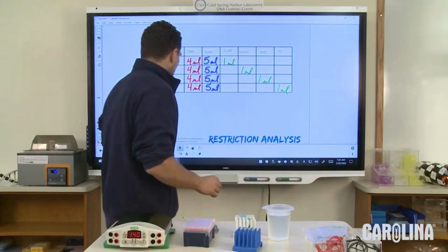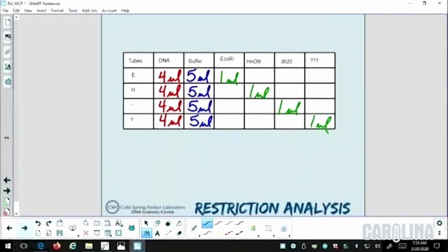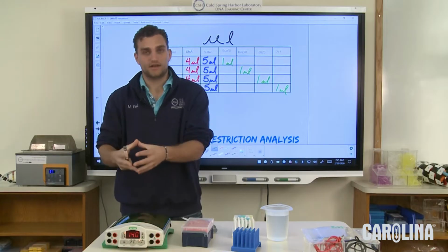Now, if you look at this, it has this little symbol in front of the liter symbol. Does anyone know what that symbol means, what that prefix is? What does that stand for? It's a Greek letter called mu, and yes, micro. So it is the microliter. Now, a microliter is 10 to the negative 6th of a liter.